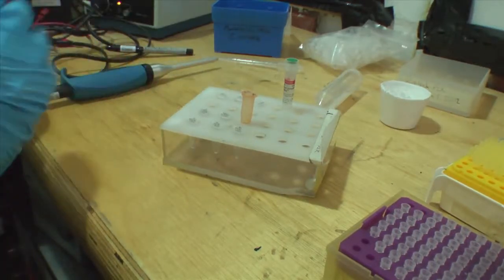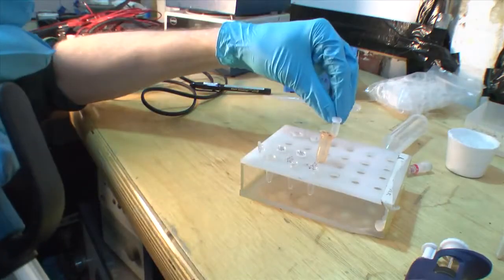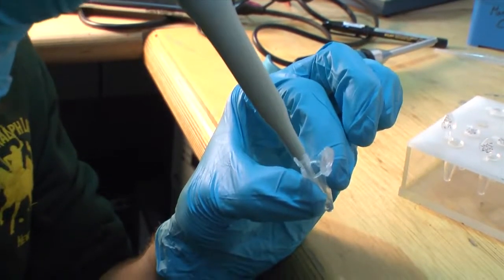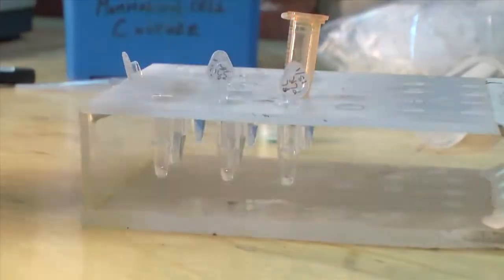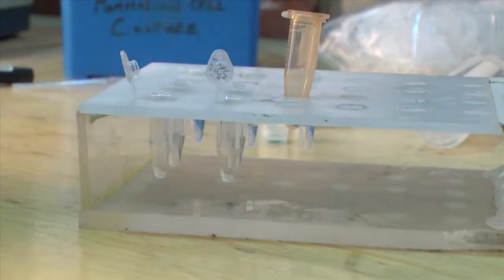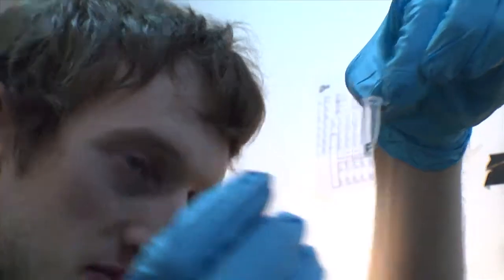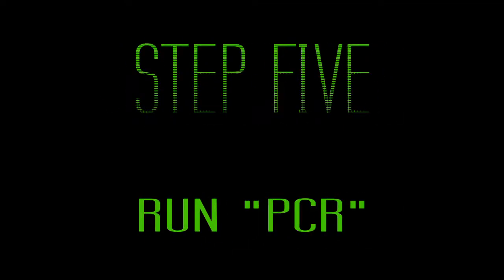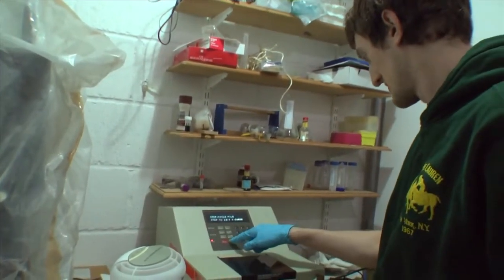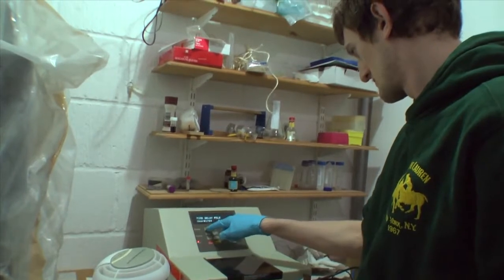So, we're going to add the water first — 2.5 microlitres. It's a Taq ready mix, so we put in 12.5 microlitres of each of these. When it's not in use it should be kept nice and cold. We're just going to start the PCR reaction, which will take about two hours.